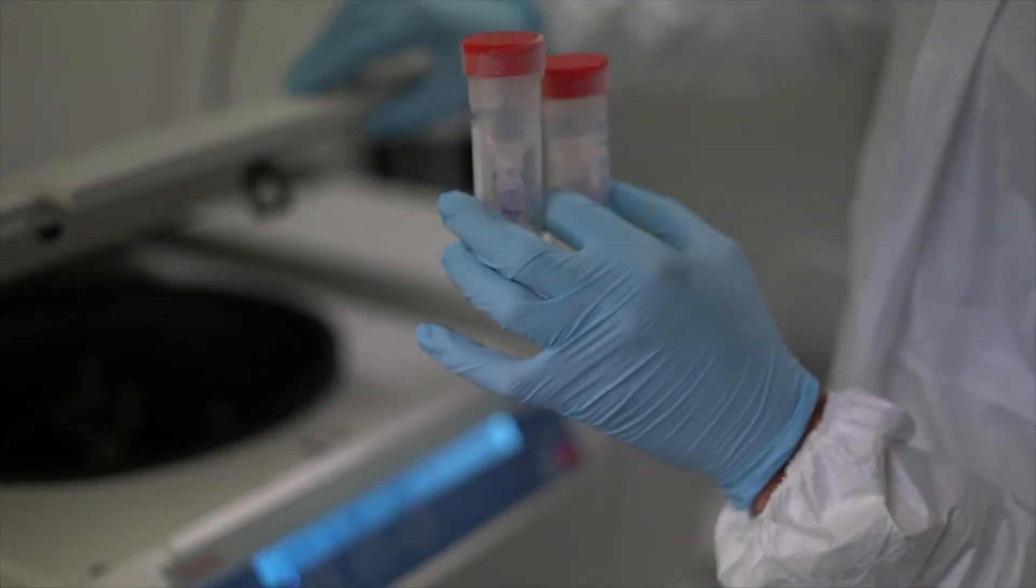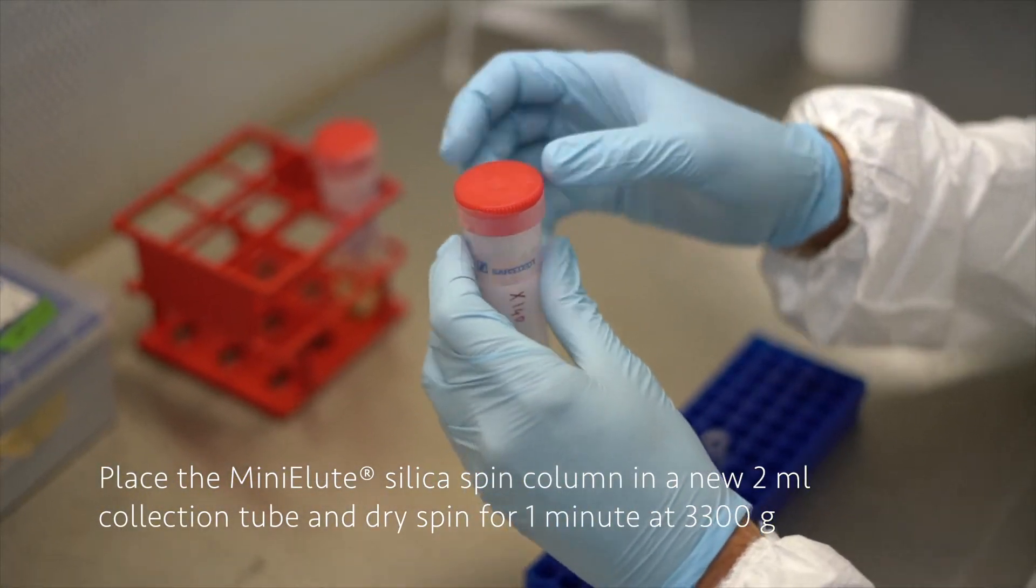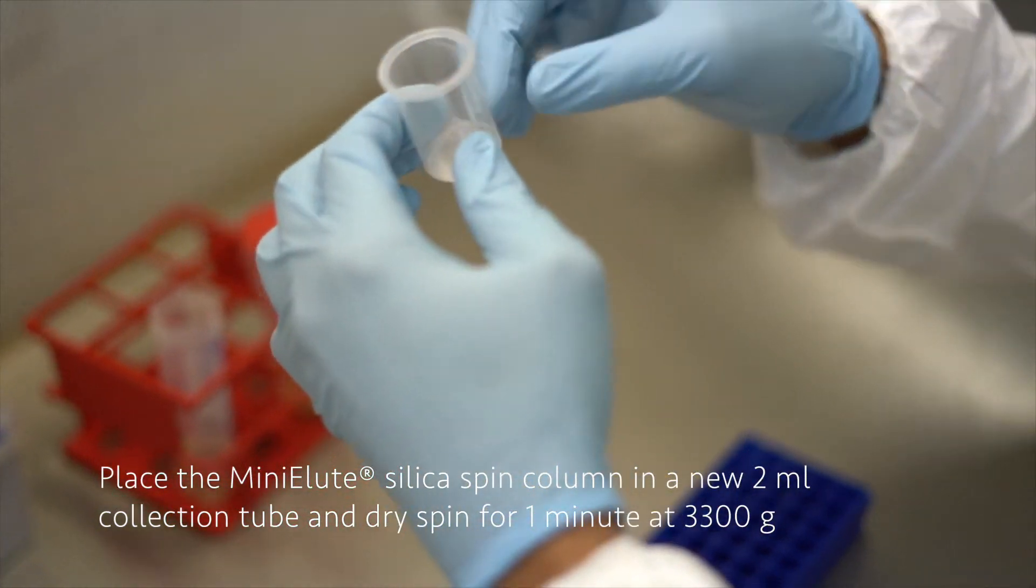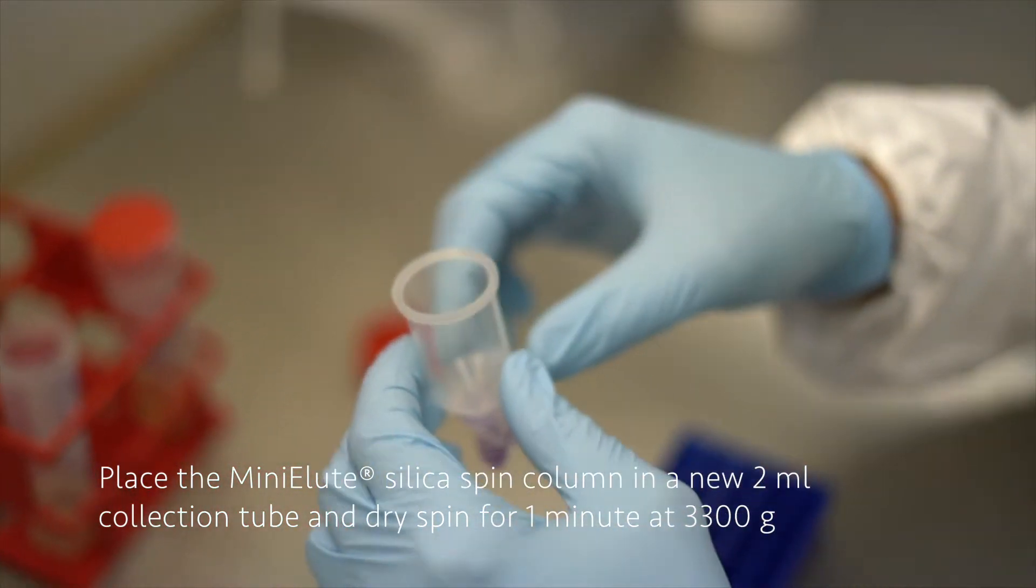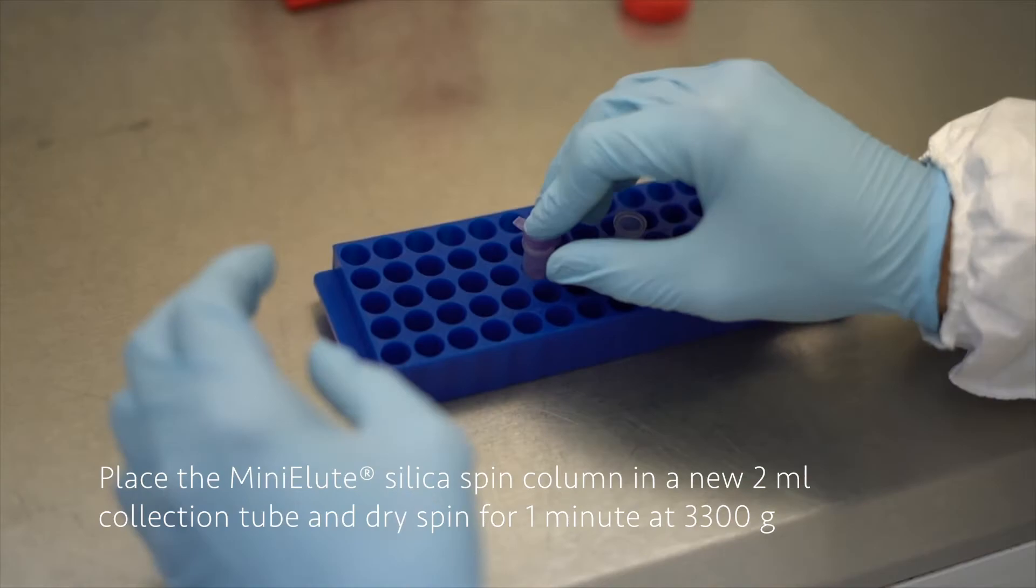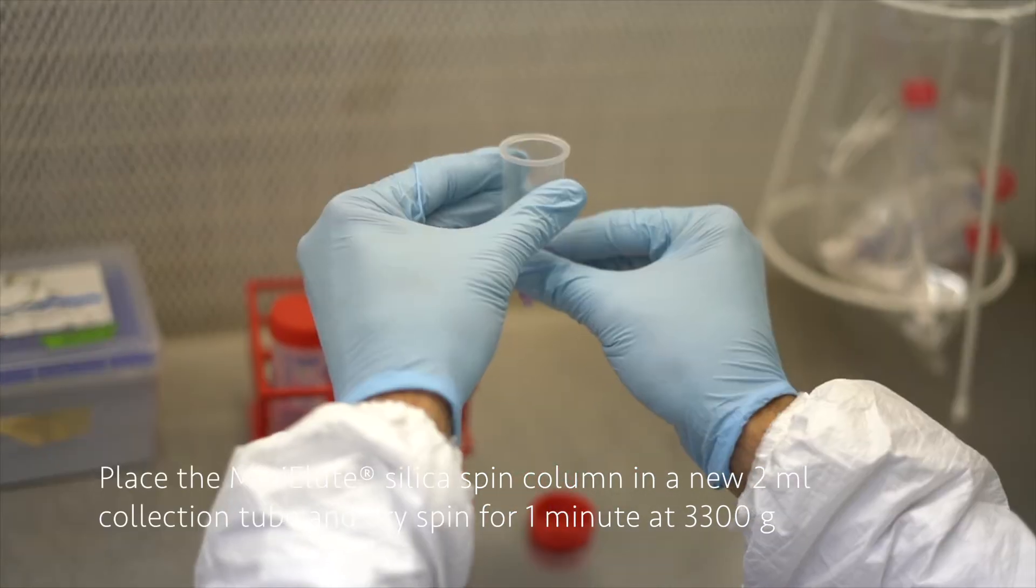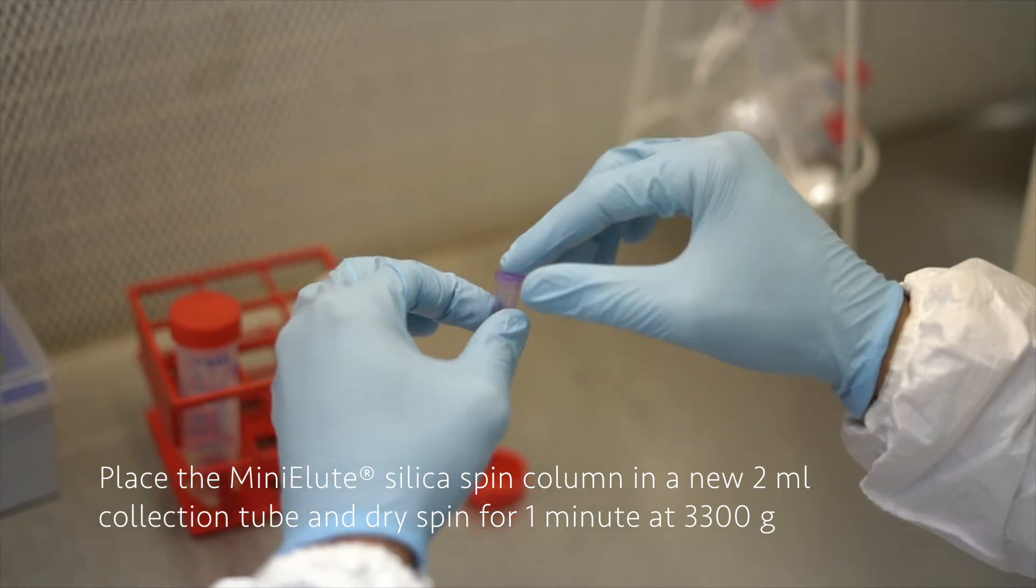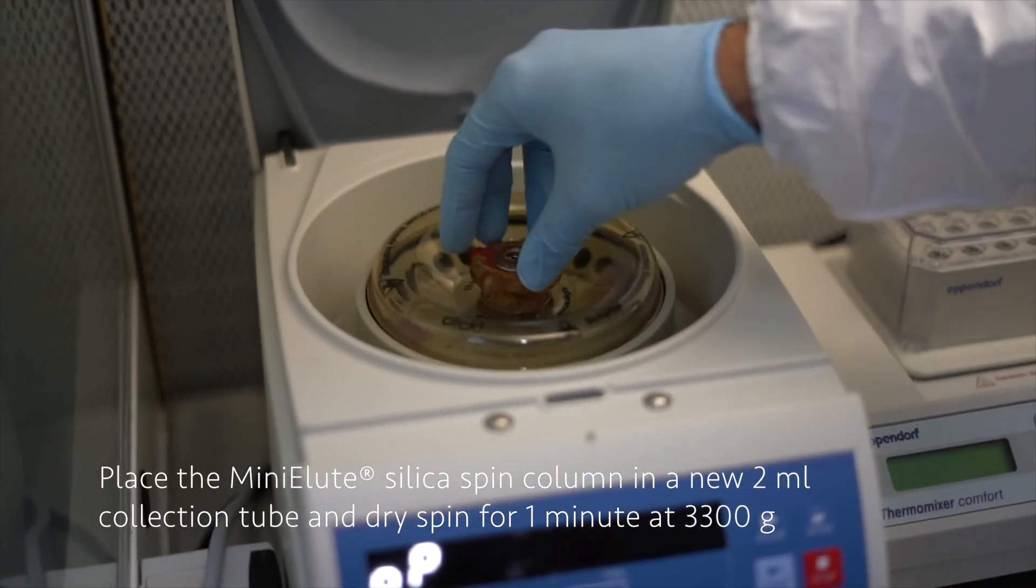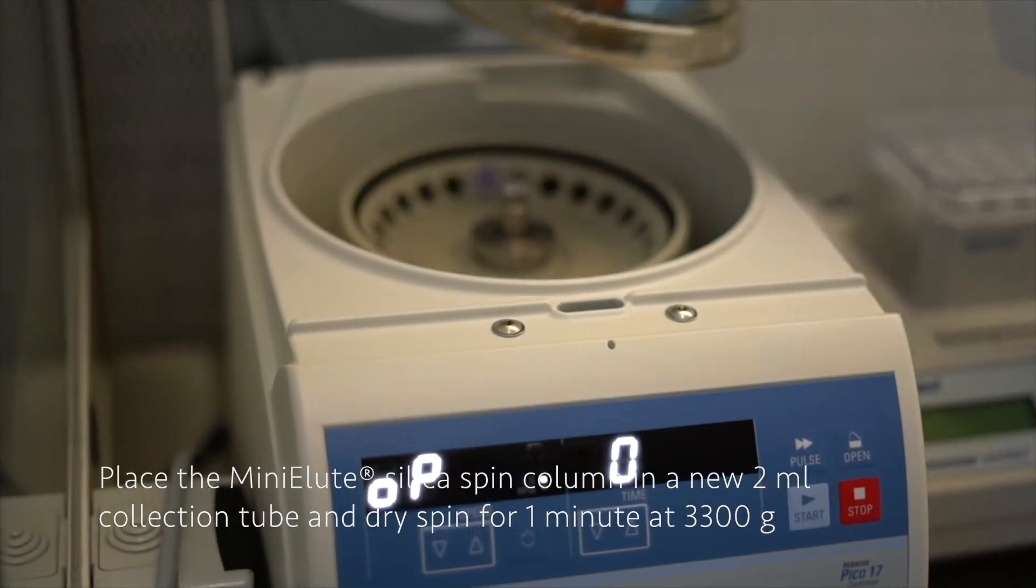What we have to do next is to disassemble the binding apparatus and place the MinElute column back to the 2 milliliter collection tube. You have to be a bit careful doing that, especially in this case where there is some fluid still in the MinElute silica. Now we have to dry-spin the columns in a bench centrifuge at 3300 g for 1 minute. We have to be sure that everything is flowing out of the MinElute silica column.